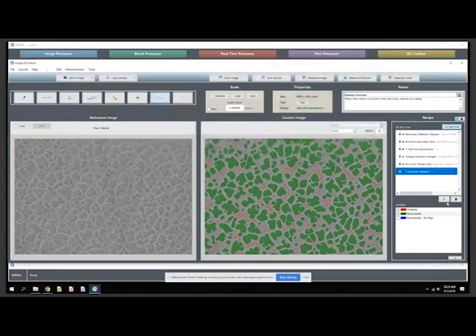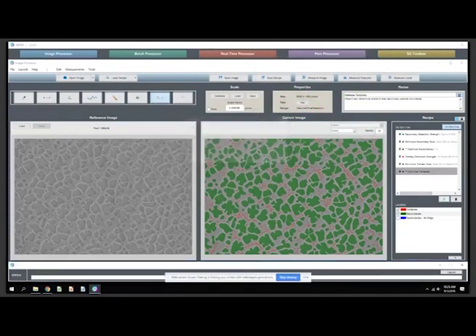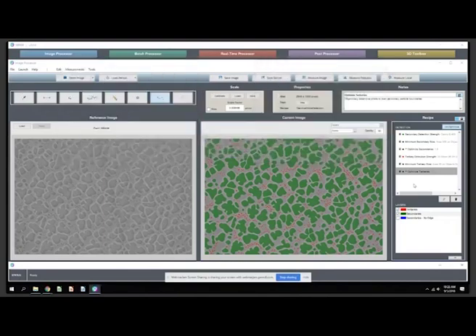And you see then we've done the same things on the tertiaries. We've shrunk them iteratively from 0 to 5. And it comes back and says, nope, they were good as they were. They don't need any shrinkage. They're already the best match they can be. So that's optimization, and that was really key in coming up with this solution.